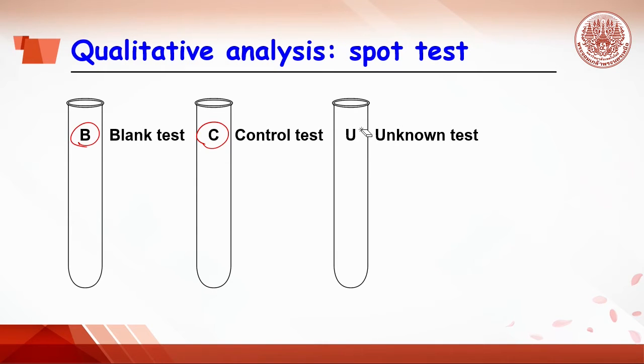The last test tube labeled with U means unknown ion. The unknown sample will be added. If it reacts with the same reagent as control, the positive or negative test will be shown depending on what ions are in the unknown.